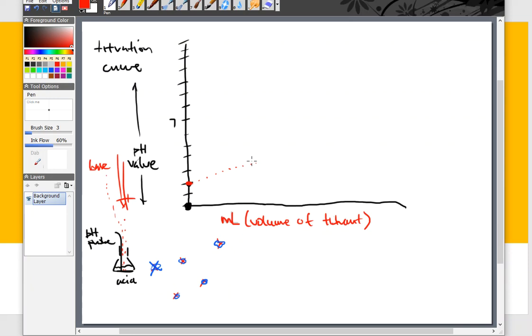And that's because there's less and less acid that's involved. There's less acid that's present. It's getting neutralized by the addition of the base that I'm giving it. So base goes in, you're coming home with me. And then it grabs the kids and it takes them away. And there's less and less kids in the pool as the time goes on.